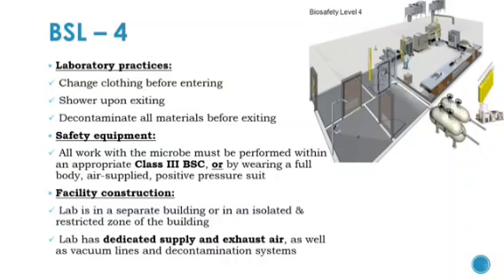Laboratory practices. Change of clothing before entering the laboratory and shower upon exiting the laboratory. All materials are to be decontaminated before exiting the laboratory. Safety equipment. All work with the microbe must be performed either within an appropriate Class 3 biosafety cabinet or by wearing a full body air supplied positive pressure suit.